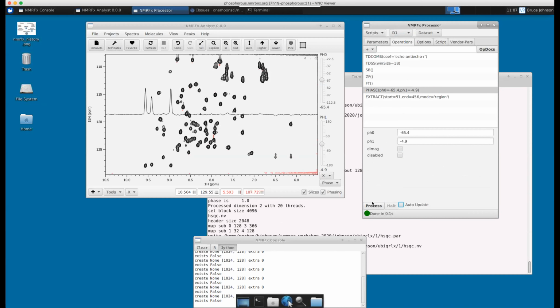Hey, Bruce, I think you got a hand up. I got a hand up. Okay, I'm sorry, I don't see these things, but go ahead, whoever's there. Hey, Bruce. It's Doug. Yeah. It's a really basic question. When you do the slices, can you move the location of where the slice is located on the window? Yeah. Let's do that.